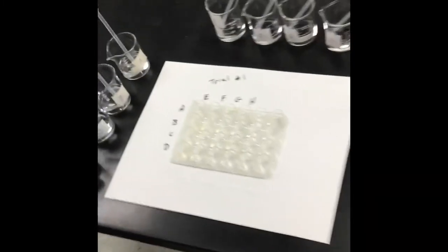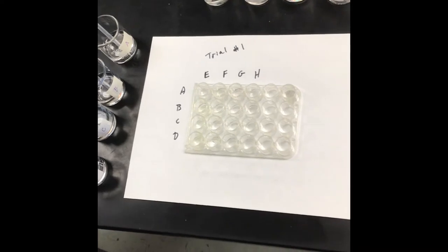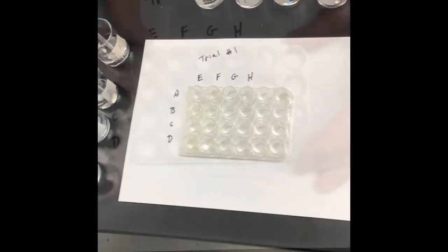I'll do different directions to try and give you some perspective about what each one is, but really you have to pay attention to what's happening, how fast they happen when they change. We are going to use phenolphthalein as our indicator, so I have added phenolphthalein to each of the acids that are unknown here. So we're going to go ahead and get started in just a second. So let's pause the video.